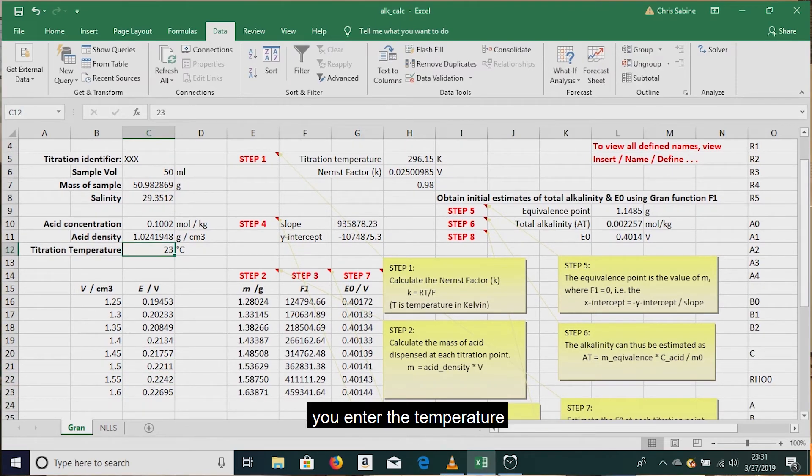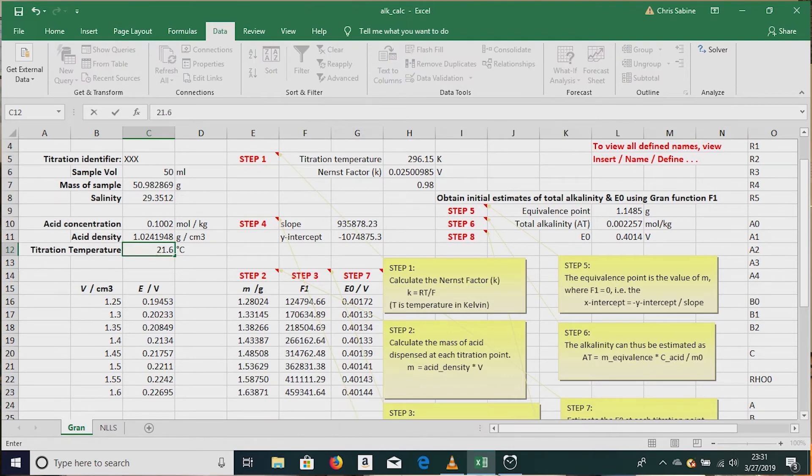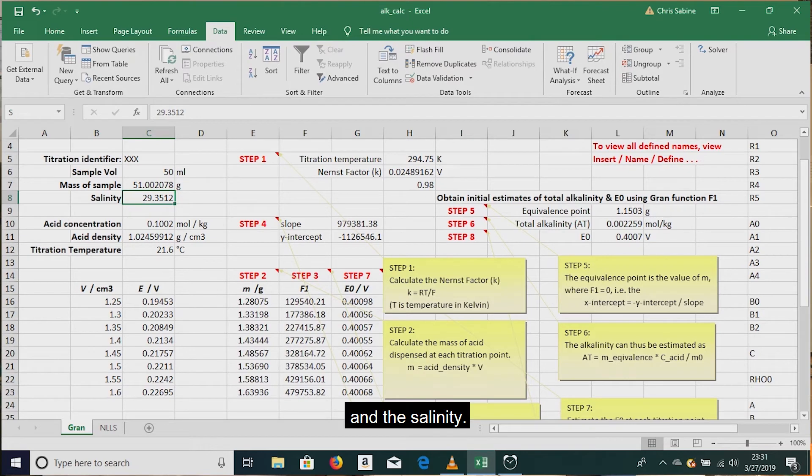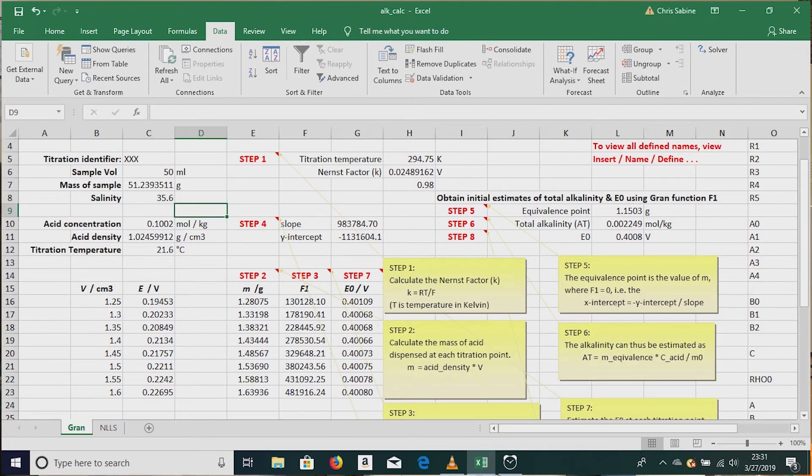I want to make sure you enter the temperature and the salinity. Then you have your preliminary alkalinity estimate here, so it's 2276.